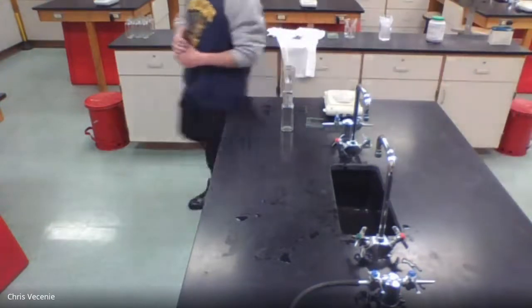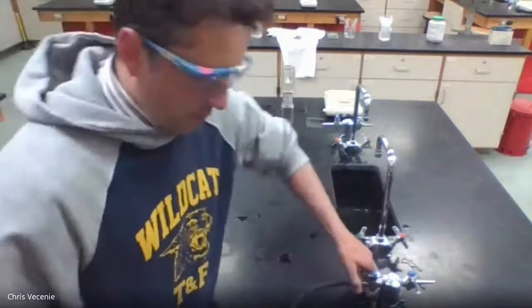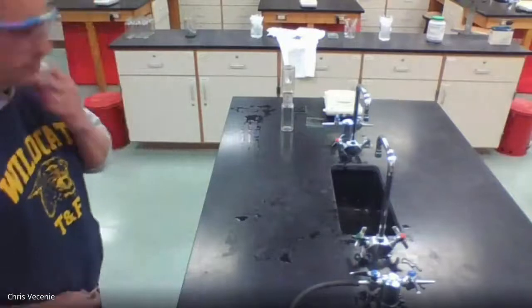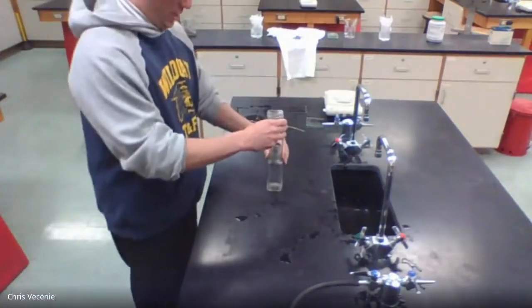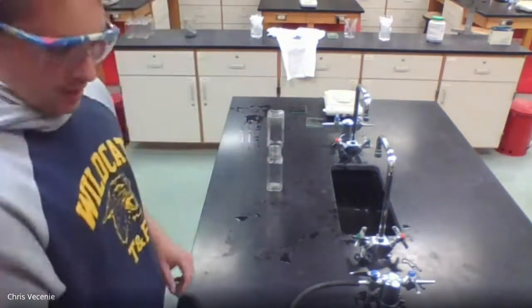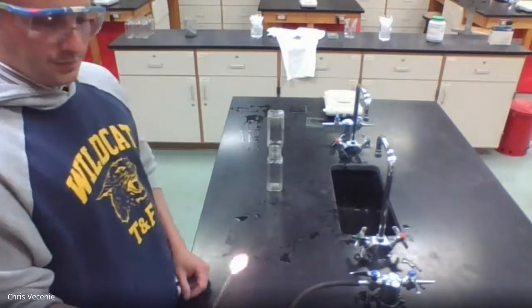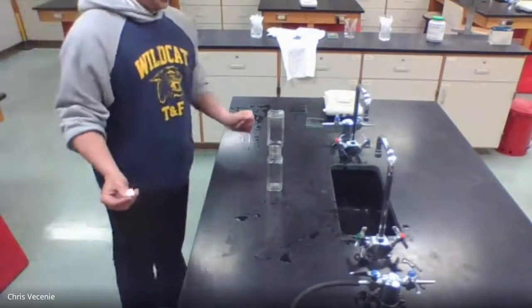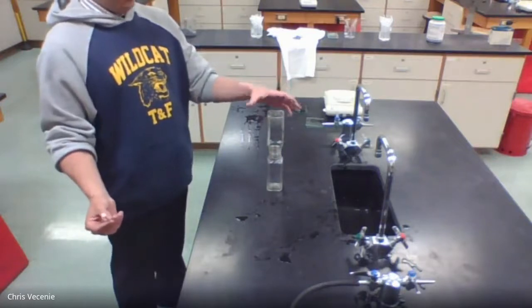Okay, so it is now 8:43. We are going to test our two bottles, and what we're testing for is the idea of diffusion. So I'm going to test the top bottle, and I'll test the bottom bottle. If they both relight and or bark, that means it diffused. If one does but not the other, no diffusion. If neither do, we lost our hydrogen.